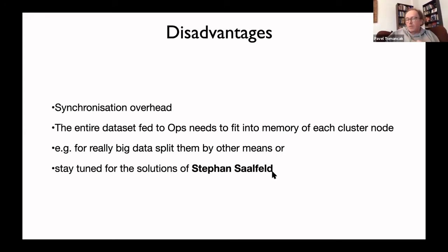So what I showed you was more developmental, more practical stuff, on the type of data which many of us might encounter. And I think the take home message here is that there are now ways to do it on very specific data sets for SPIM registration. There are ways to parallelize your macros by injecting very little new syntax, where you are in charge and you can parallelize whichever way you want. And there is also a way to use the awesome power of OpenMPI to parallelize automatically using the IJ2 Ops, but you have to be a programmer to take advantage of that.